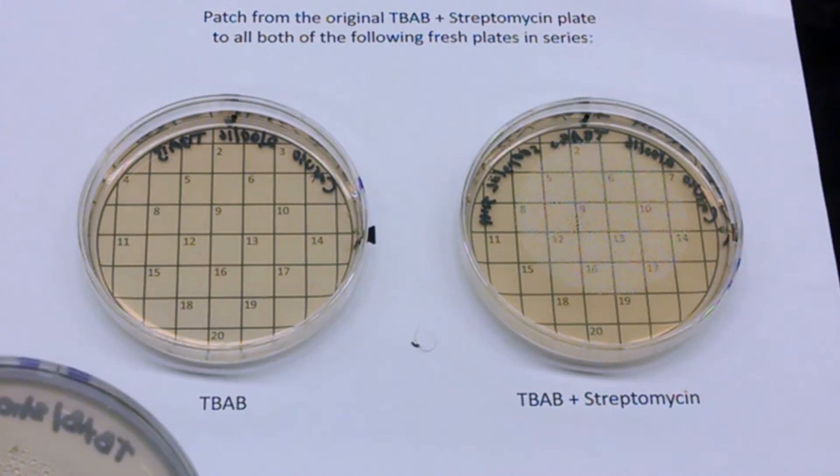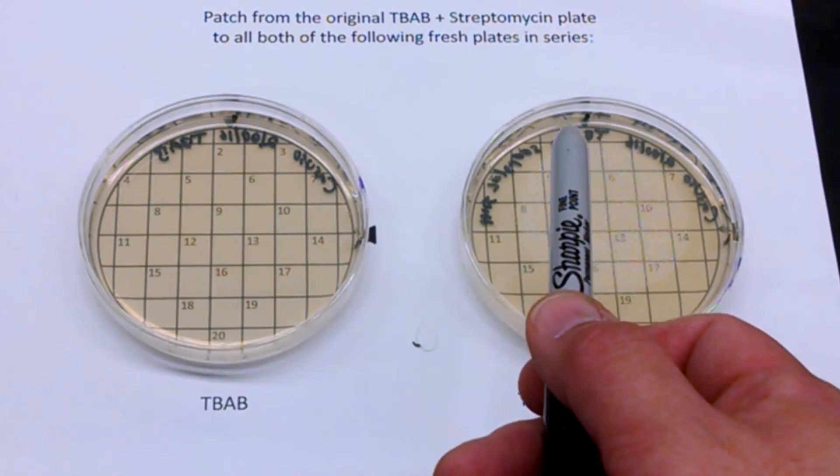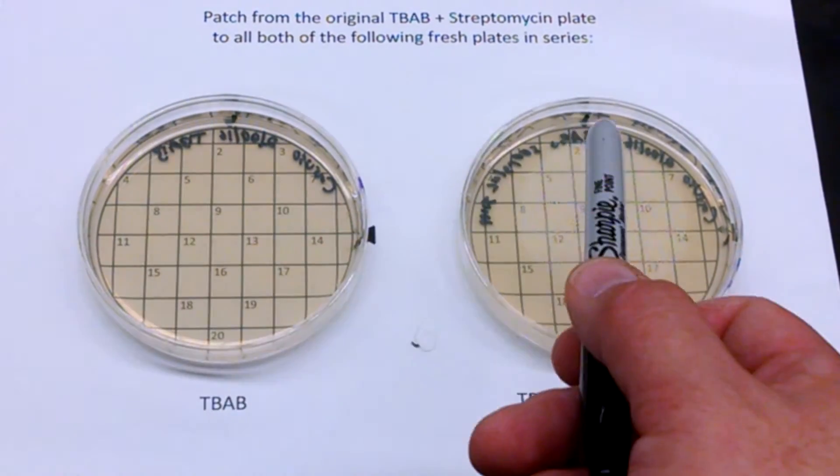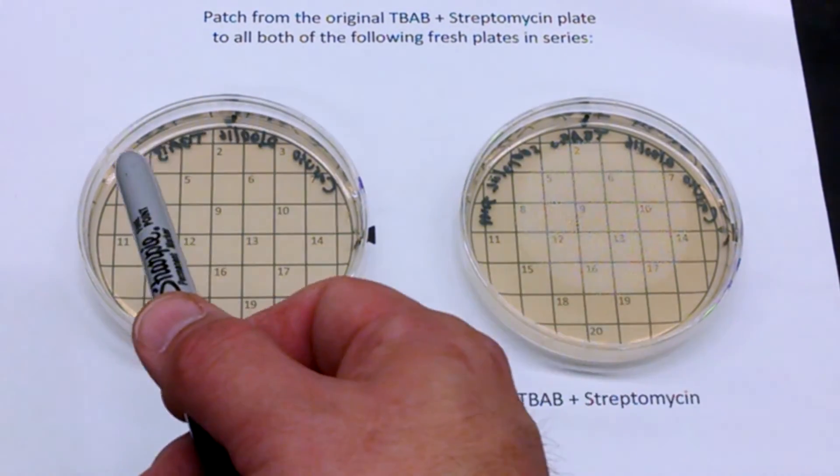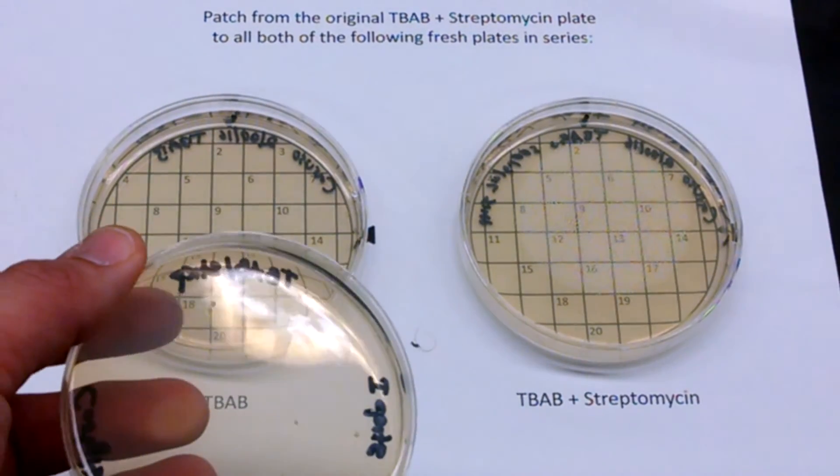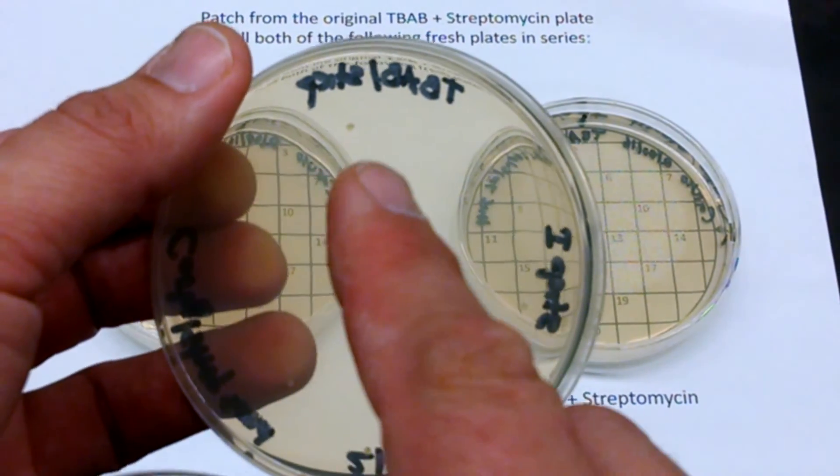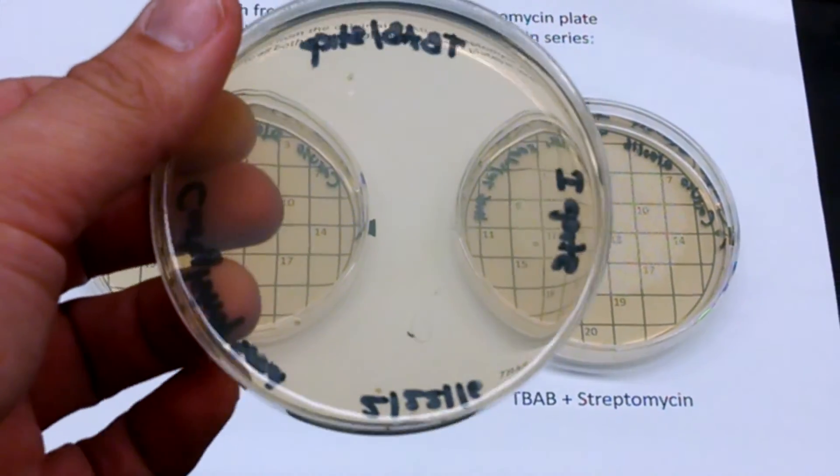And if you touch a colony, you're going to put it in the same box on both plates because you want to be able to find it again. You know that it grew, how well it grew on each plate, so it'll be in the same place. So for example, we're going to take this colony right here. It's a little hard to see, but there's one right there. So we'll start with that one.